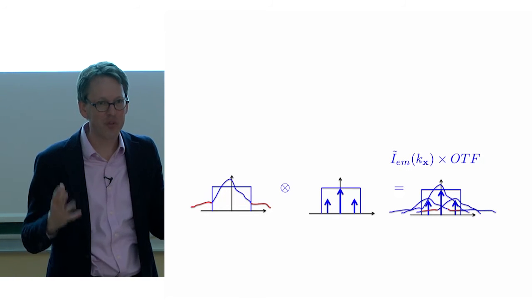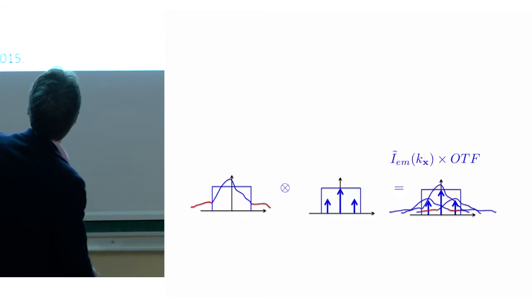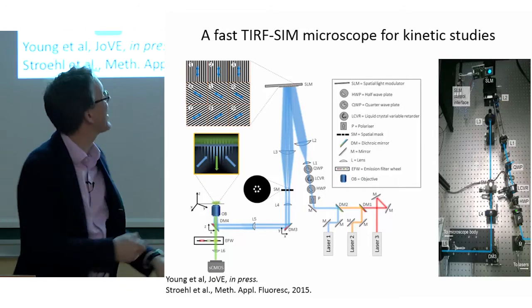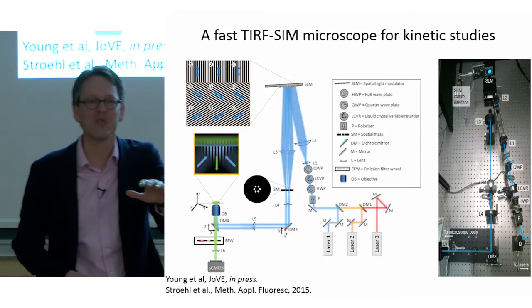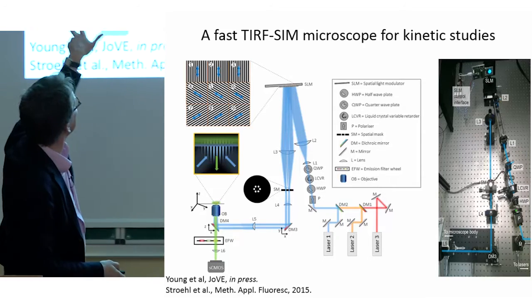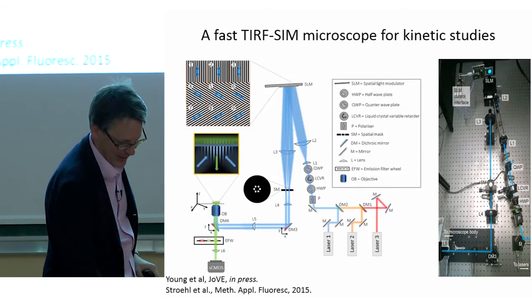calculations. So it's a computationally very intensive method, but in practice it's very simple. We use spatial light modulators and sort of a little bit of optics, right? And we very quickly project patterns, lots of patterns onto our sample at the highest spatial frequencies we can do with our system. The finer the patterns, the better resolution, right? And we rotate the patterns into different directions and then get the information back.